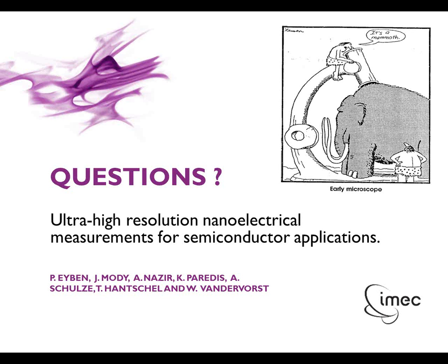Let's see, maybe one more here on the organic solar cells, PCBM, P3HT. How can you distinguish them by KPFM? Maybe we can follow up there later if there's any literature on that, but any quick comments on KPFM on PCBM, P3HT? They have different work functions. Yeah, okay, that's what I thought also.